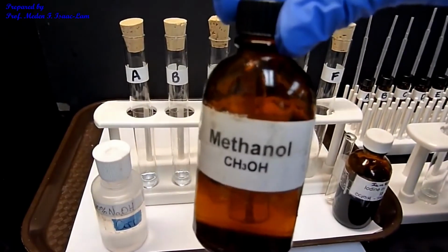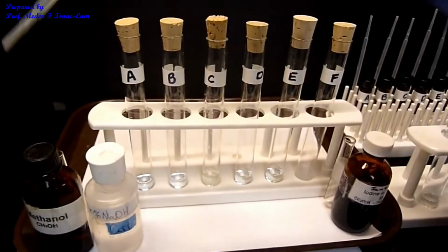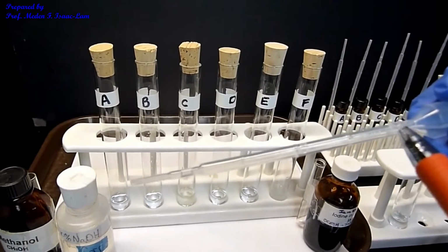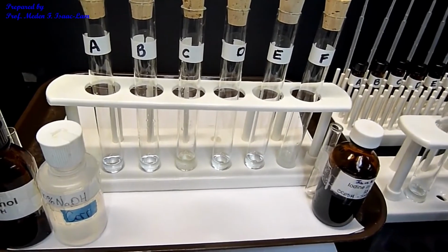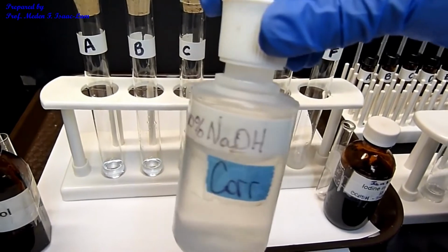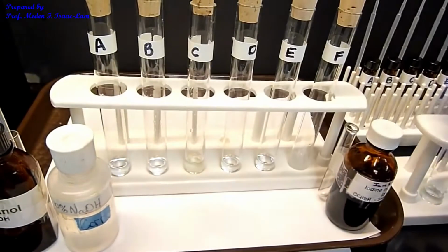So methanol, I put 20 drops or 1 ml using the calibrated pipette. So this is 1 ml. I also added 1 ml of sodium hydroxide. So 10% of sodium hydroxide, because it has to be in basic solution.